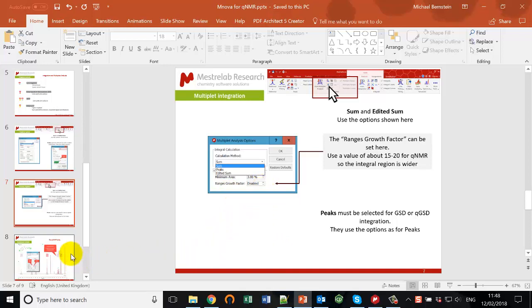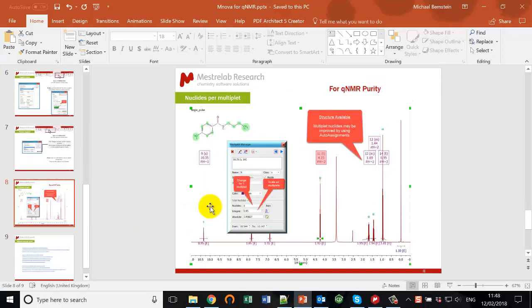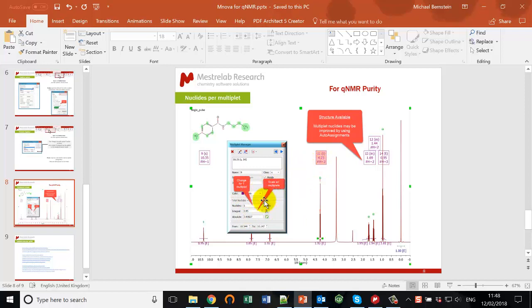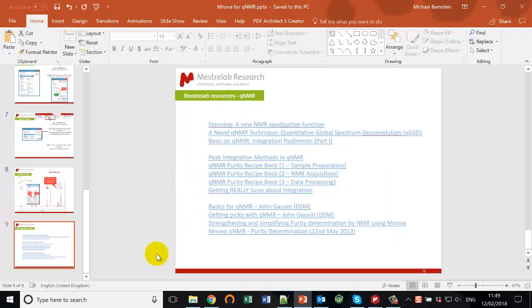A little about nuclei per multiplet: for a multiplet there's an integral value together with the number of nuclei corresponding to that multiplet — for example, the number of H's is 2 in this case — and this is where you would change things if those weren't correct. Another way to get the number of nuclei correct is to use the structure if you have it available and perform auto assignments. If we have a structure and the spectrum that goes with it, then using auto assignments will give far more robust nuclei per multiplet counts, so I encourage you to do that.